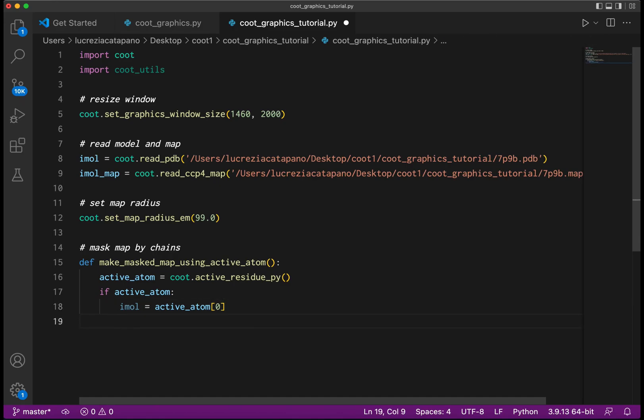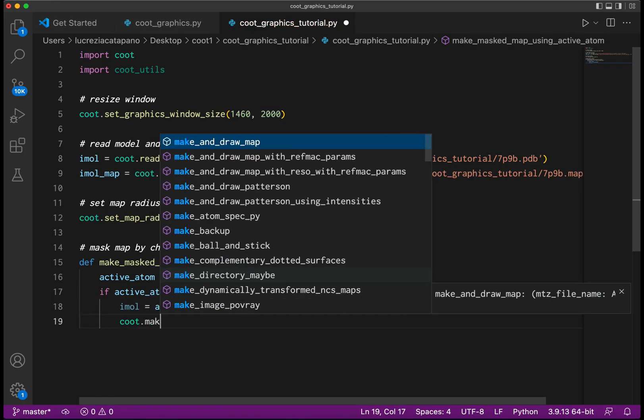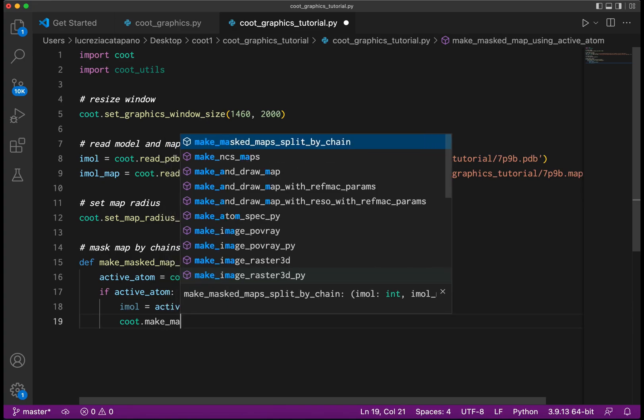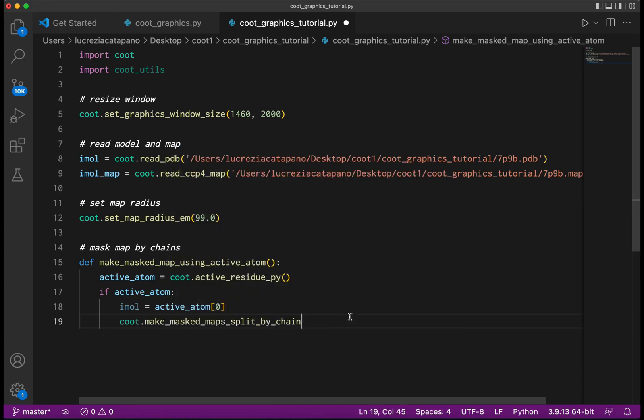The function to do the masking is make_masked_maps_split_by_chain, and we give it the index of the model and the map.